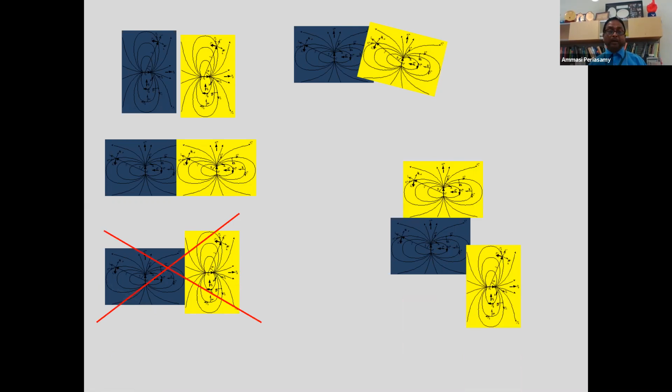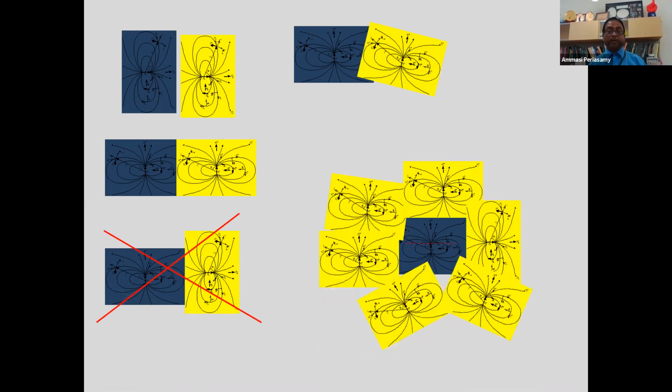But in biology there is often not a one-to-one situation; there will be more molecules surrounding the donor. In this kind of situation, you may be measuring an average FRET. That's why we say the FRET efficiency is not absolute, it is an approximate estimation of the energy transfer efficiency.